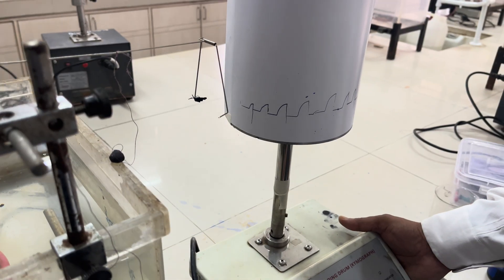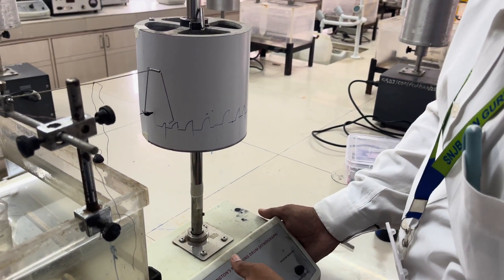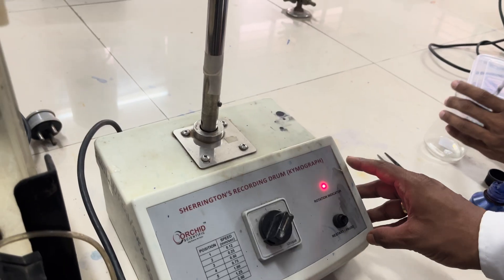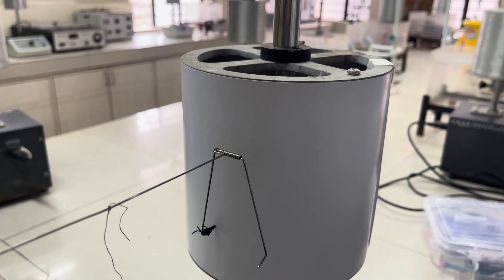Then attach the kymograph to the lever. Start the rotating kymograph recording drum. You will get a baseline recording for 30 seconds.